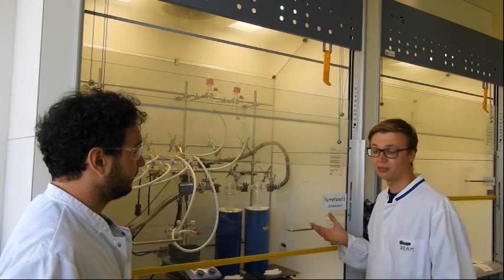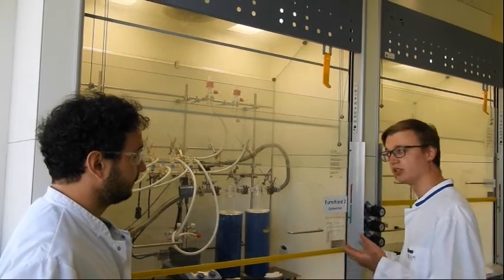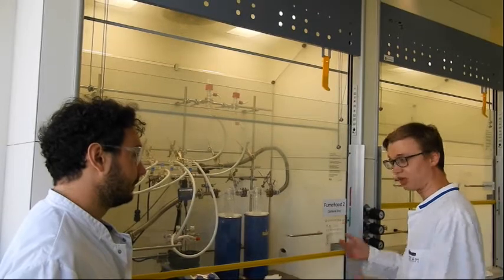Catalyst today, right? Yeah, we're going to do that using the Schlenk line. This is where we do air and water-free chemistry. And today we're going to do colloidal synthesis, where we create metal nanoparticles using ligands to steer their size and their shape. So I'll show you how.